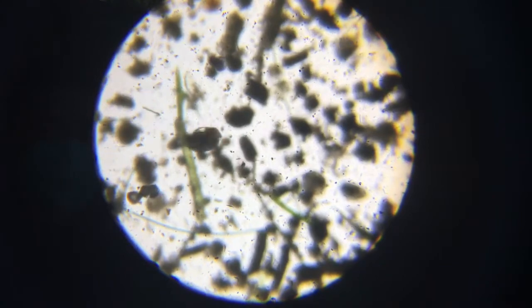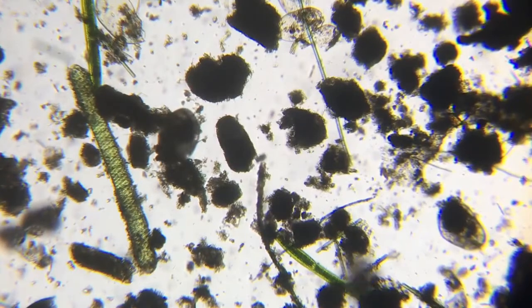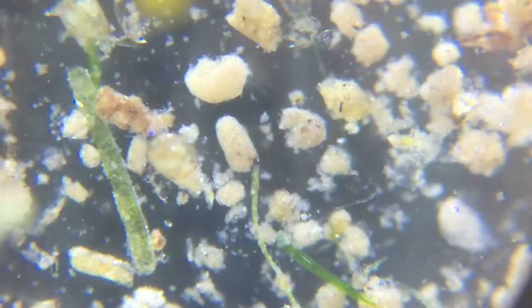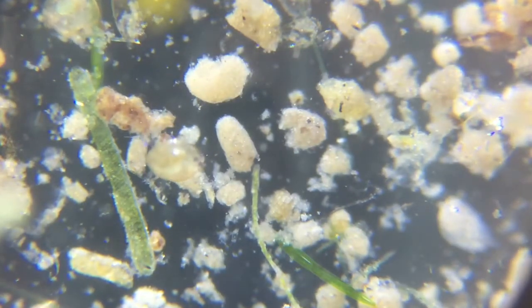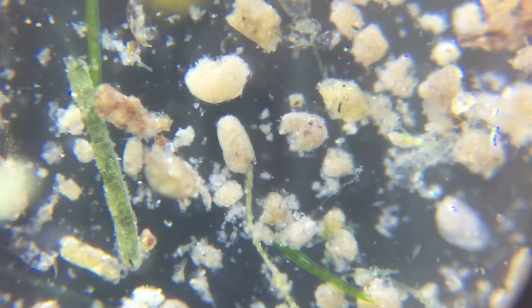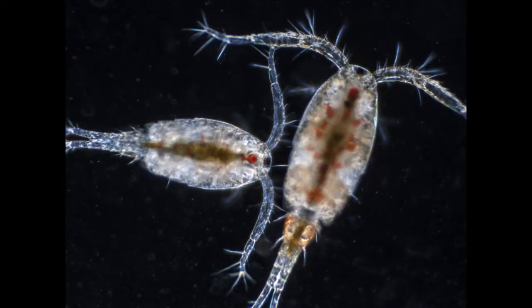All of these organisms you see here are from a pile of mud, or a habitat of mud. I will change the light now. This is a copepod. Notice those 2 red dots. Those are the eyes. Here is a better picture.